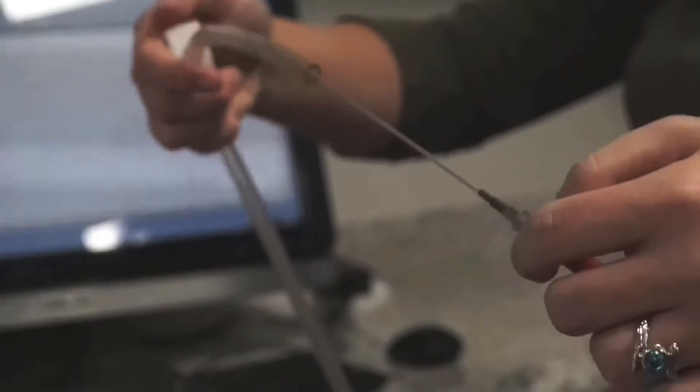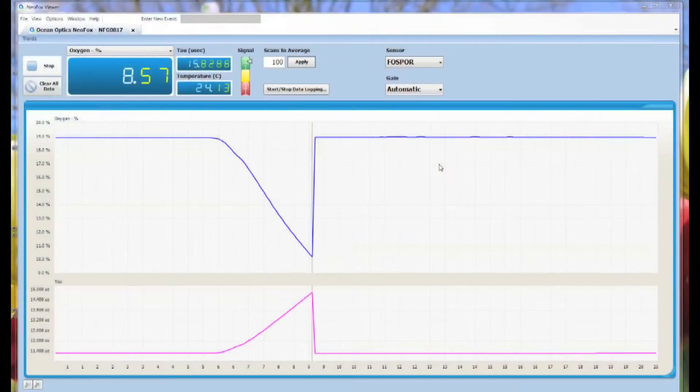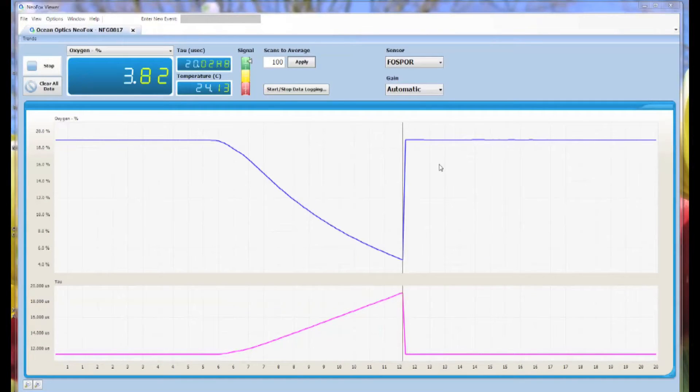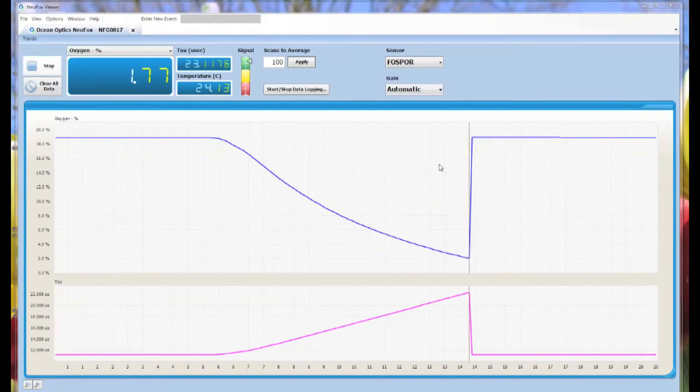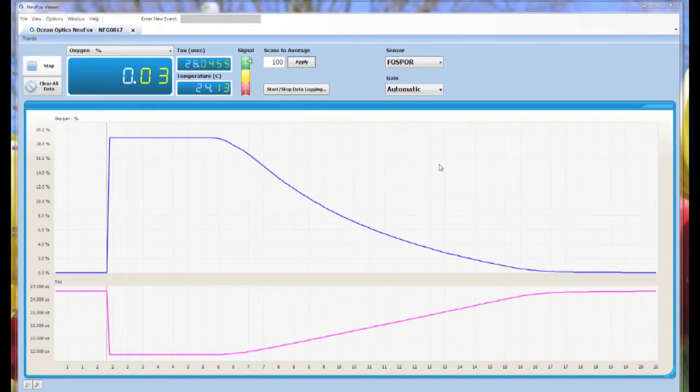For your 0% oxygen point, simply release the gas over the tip of the probe until your signal stabilizes in the NeoFox viewer. Depending on the type of probe and chemistry you have, this can take anywhere from 10 seconds to a minute and a half.